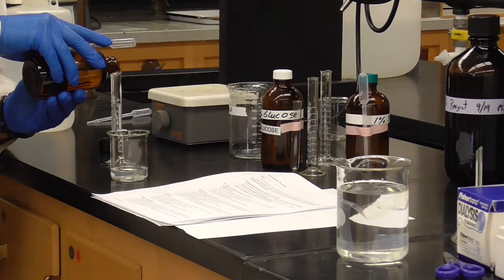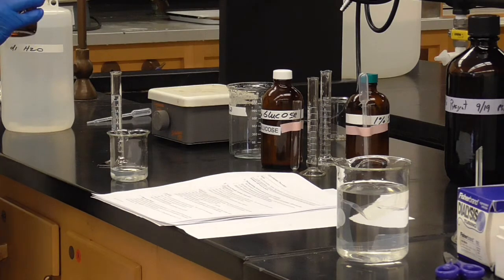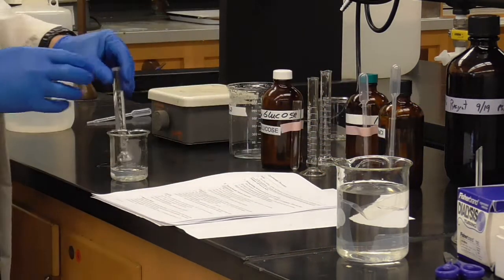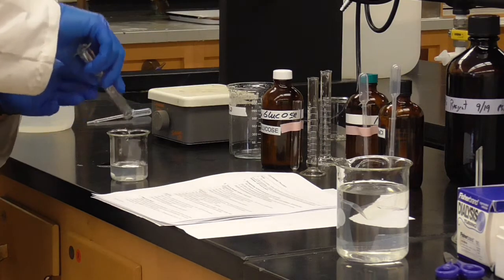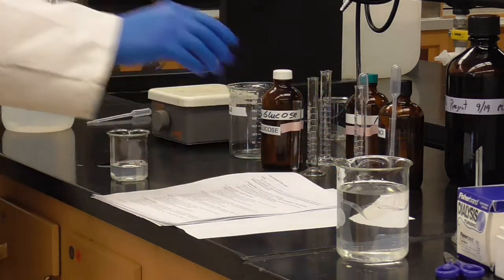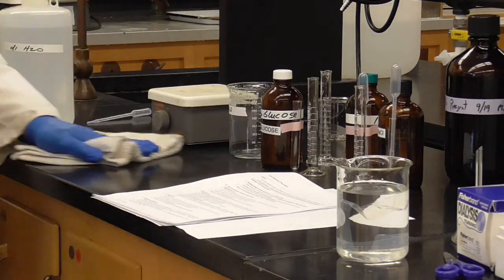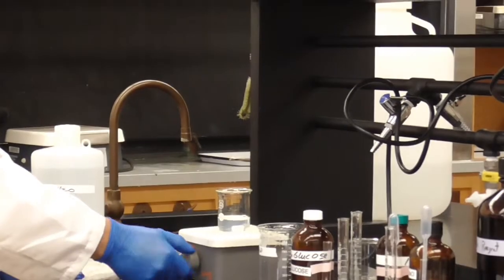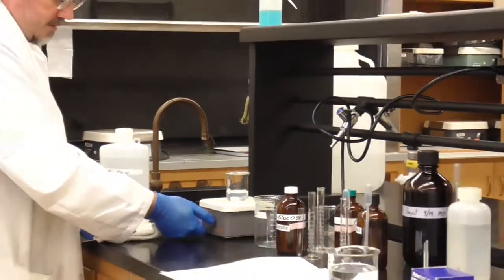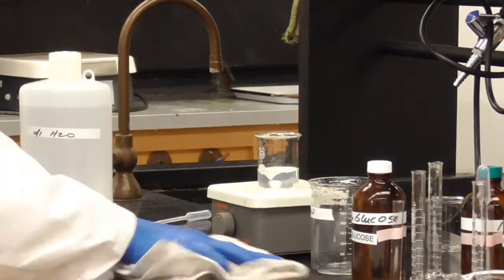This one I'm dribbling a little bit. That's okay. Sodium chloride is not dangerous. Got a little bit of it on the countertop. That's okay. Pour that down. All right, so here's my solution, and we've got a little magnetic stir bar in there, so I can put it on here and turn this on, and that starts spinning. That'll just mix it up, make sure it's all mixed very well.